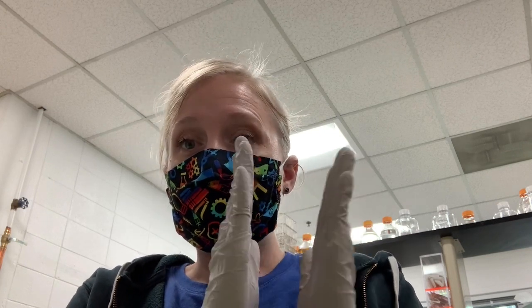And I'm going to load a gel with one lane of the ladder. I'm going to add 2.5 microliters. You can add 3 microliters if you want, but just be really careful to note how much you add. That's the hyperladder 1 kb. I'm going to skip a lane, and then I'm going to load all of my RNA samples. I'll show you what that gel looks like after I've imaged it, and I'll talk you through how to quantify how much double-stranded RNA you have.